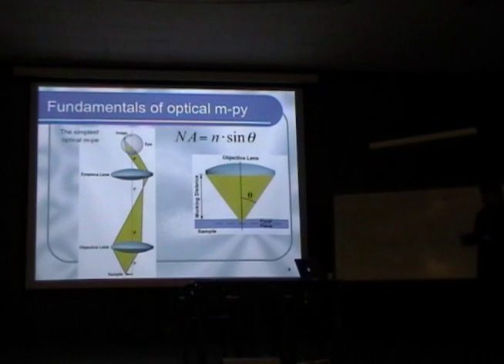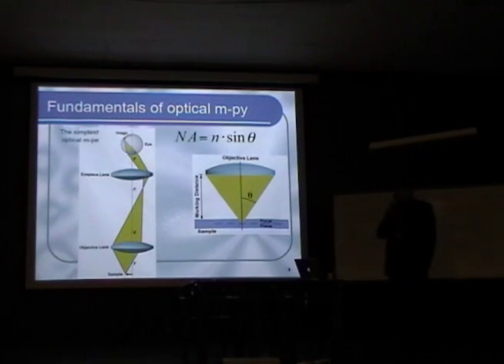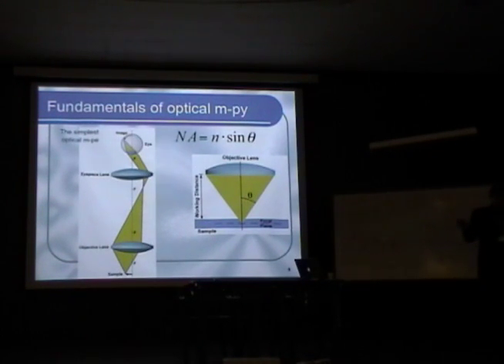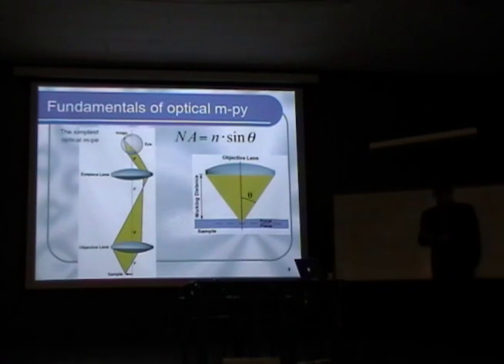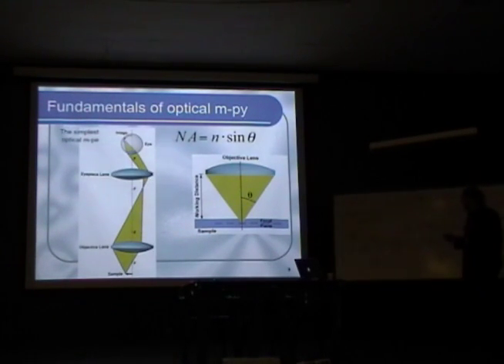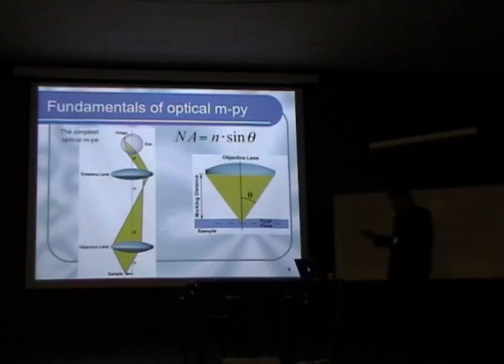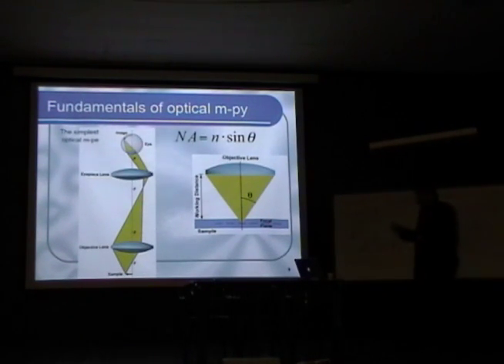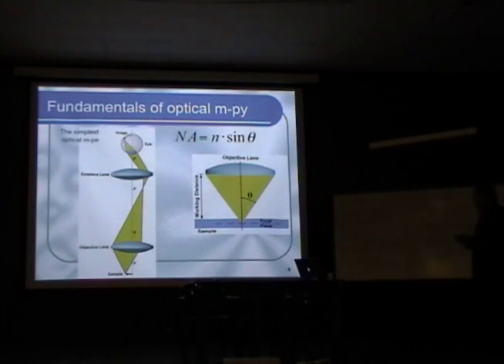Right? And so let me start from a very brief introduction to basics of microscopy. I guess in undergraduate courses or even high school courses, we learned that the simplest optical microscope can just consist of two lenses, which we call the objective and eyepiece. This instrument is intended to build an image of an object of interest, which can be viewed with our eyes or with a number of different advanced cameras, such as CCDs and so on.